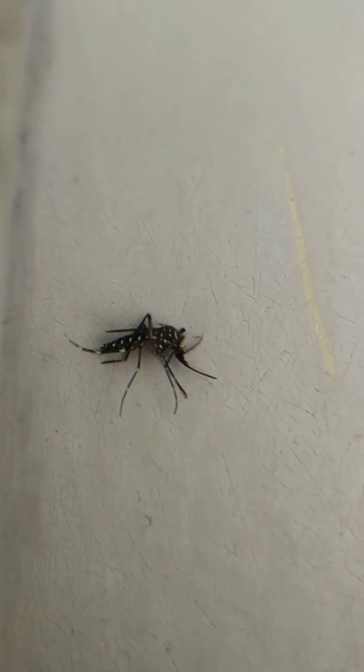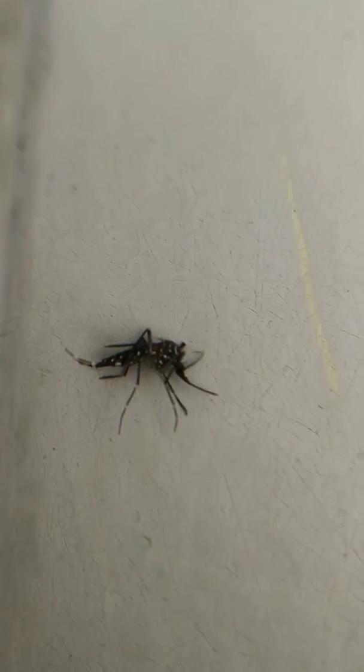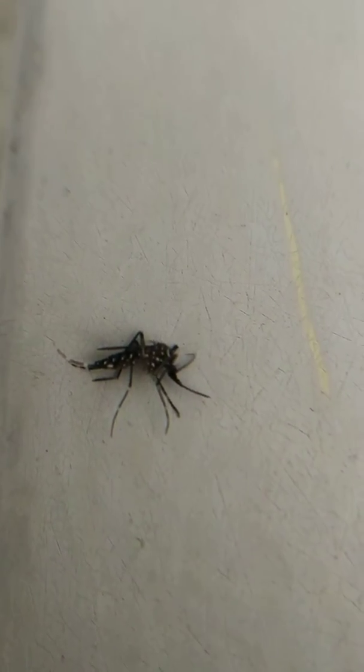This is the right lateral view of the mosquito. You can see those intermittent white dots which is typical for this particular mosquito.